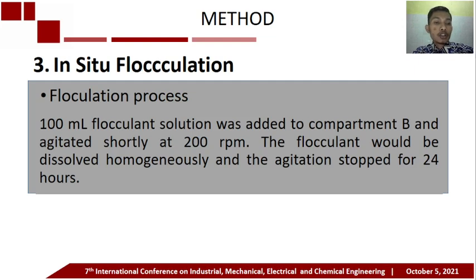Flocculation process. 100 ml flocculant solution was added to compartment B and agitated shortly at 200 rpm. The flocculant would be dissolved homogeneously and the agitation stopped for 24 hours. The flocculant solution made from polyacrylamide anionic.